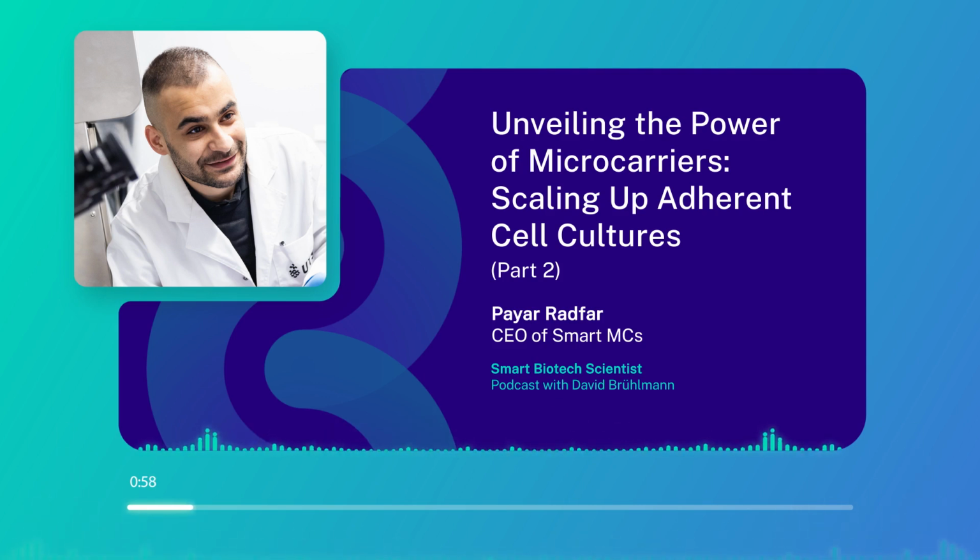Now in part 2, we're going to make it very practical and look at how you can get started. What are the easy steps you can follow to develop an adherent cell culture?